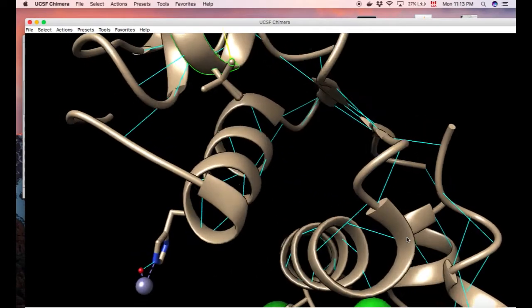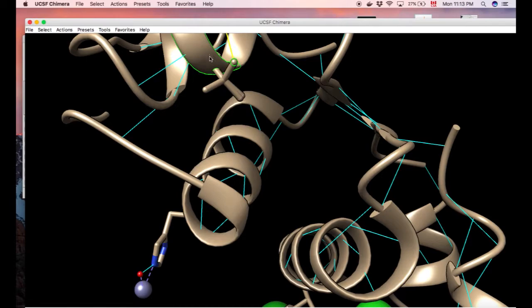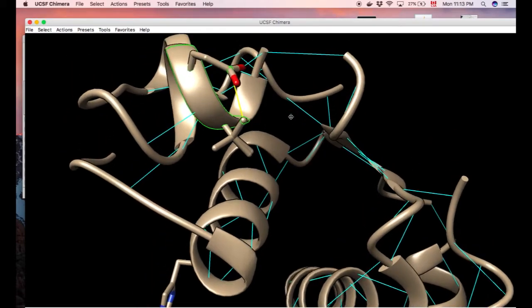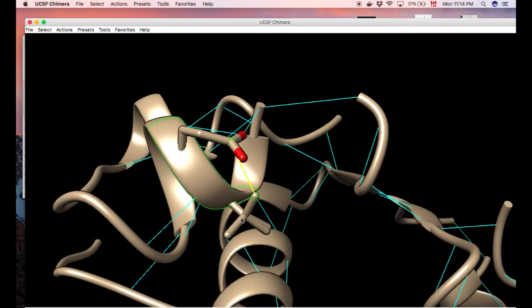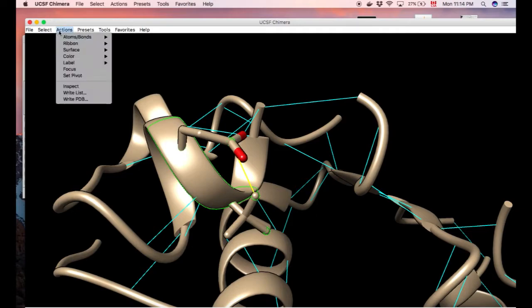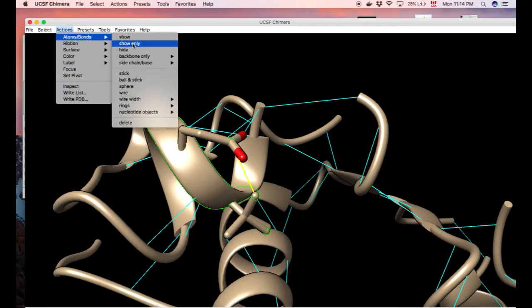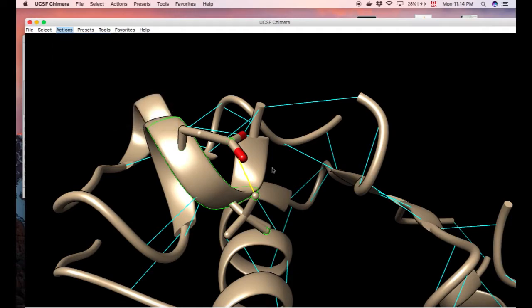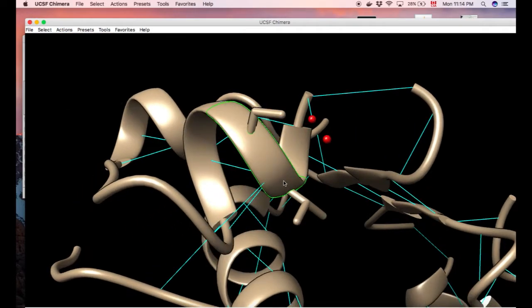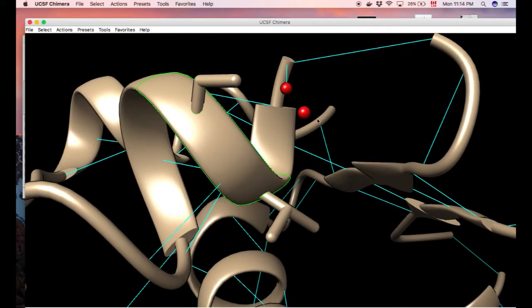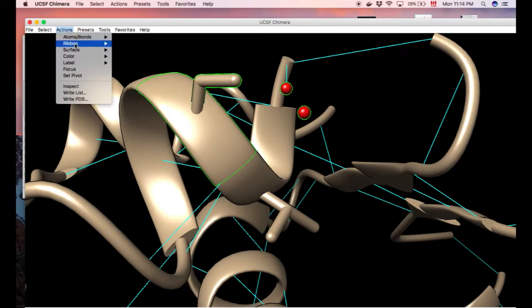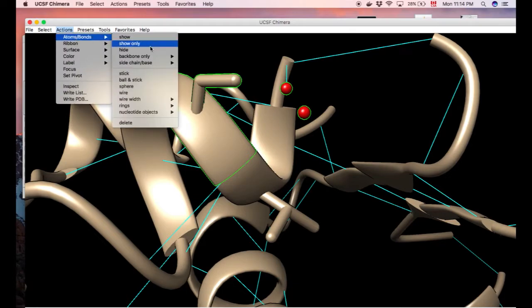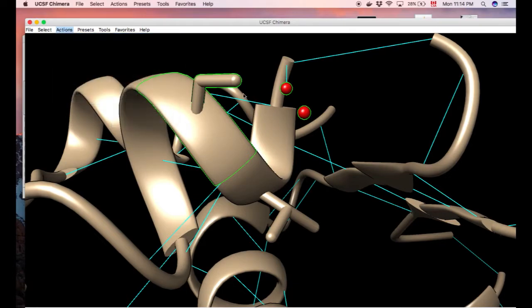Is there anything? Well, yes, there is actually a position here at valine three of chain C. There's actually a problem here. As you can see, there's a carbon binding actually four different atoms, all carbons. In this case, of course, this is not supposed to be the case. So we can just remove these atoms as if they were never there. So we can just hide them. Perfect. At the same time, I sadly removed them. So let's just select these. And once again, all of them and just hide them and show. Perfect.